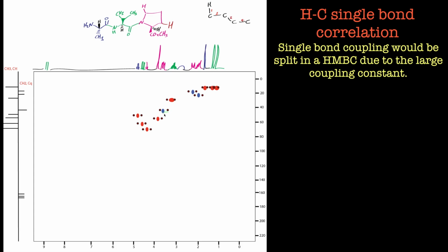If you ever see splitting of the peaks, so they don't quite line up, if I just draw a line here in red, for example this proton here comes from this signal here, but if I get rid of the HSQC, you can see now it's split into two there. This coupling constant will be the coupling constant for that proton-carbon coupling, and it's roughly about 120 to 140 Hertz. So let's say 140. They do vary, I'm just making this up really, but they're in that region. I chose that for a particular reason, and I'll tell you about that in a second.